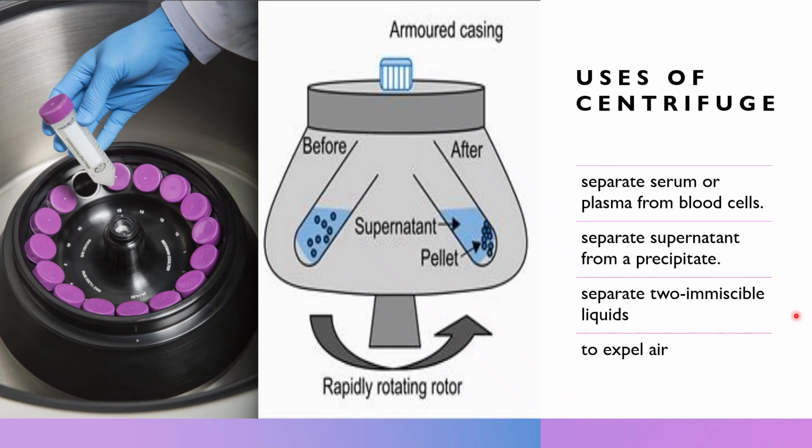Another reminder: the centrifuge cover should remain closed until the centrifuge has come to a complete stop to avoid any aerosol contamination. It is recommended that the timer, if present, and the speed be periodically checked. There are also brushes inside the centrifuge, and if present, they should be periodically checked too.